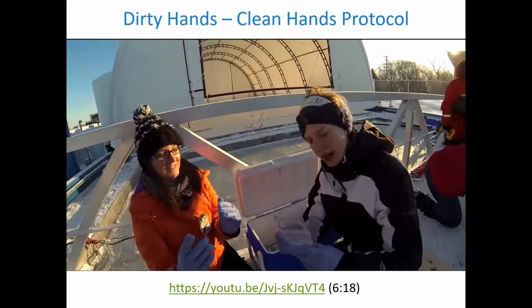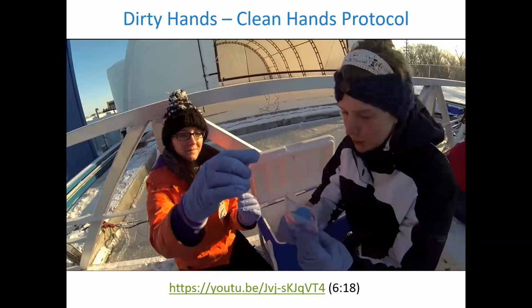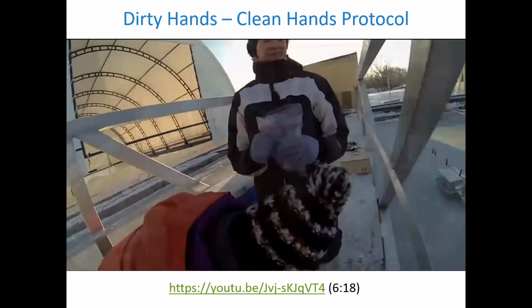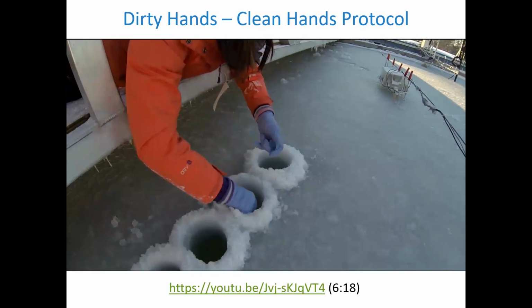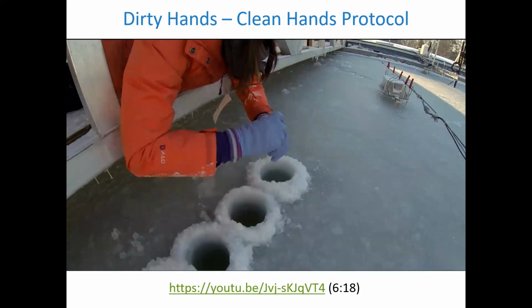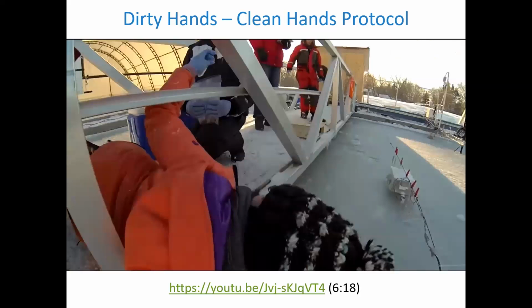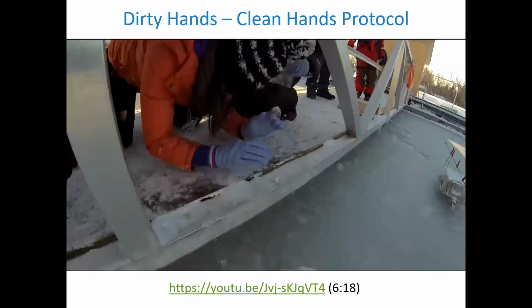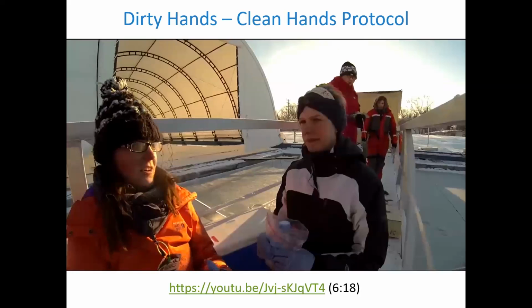And now, as dirty hands, it's my job to fiddle with the tubes. But not touch them. I push them up, don't actually touch them, and I pass them over to the mouth. Second sample. So we repeat this process 3 times to collect all 3 samples.